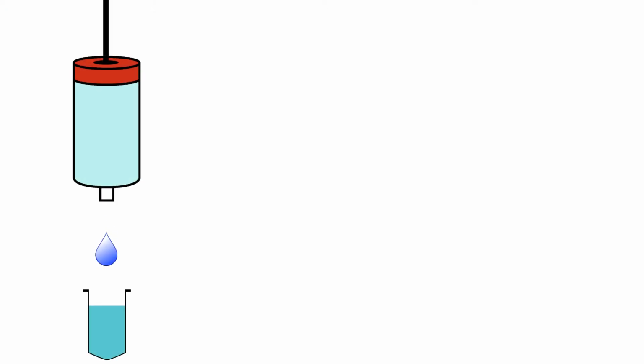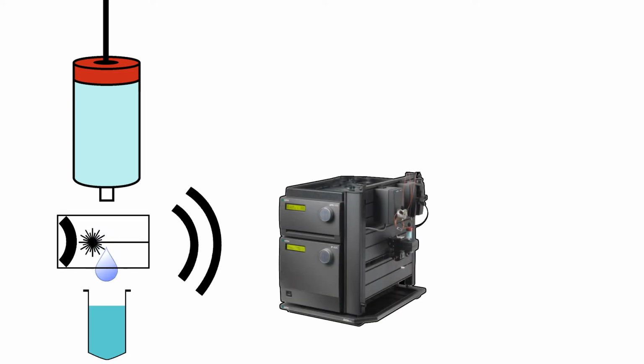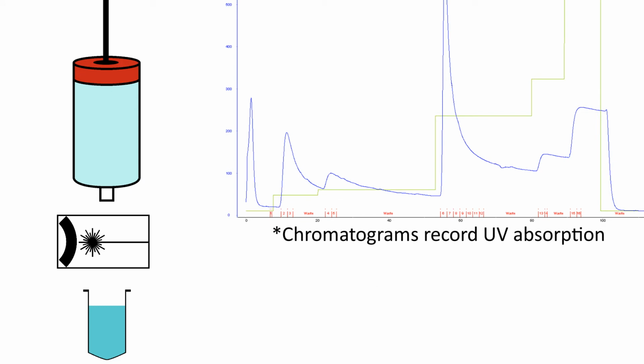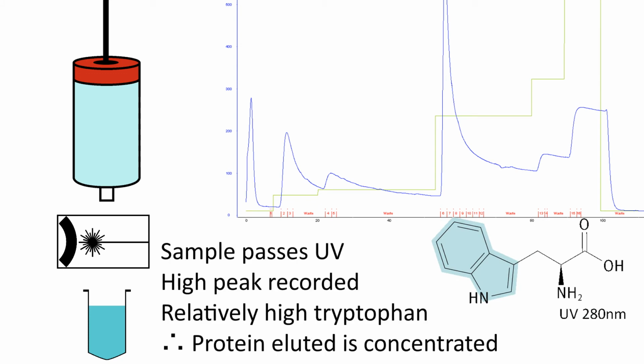The FPLC I have just introduced to you has another useful function. With the help of some software, the UV lamp and detector reads the absorbance of the sample flowing out of the column, which is then recorded as a chromatogram. The absorbance is a good indicator of protein concentration because of the high absorbance of tryptophan, a common amino acid found in protein chains. Naturally, a high UV absorbance would be a sign of high protein concentration.